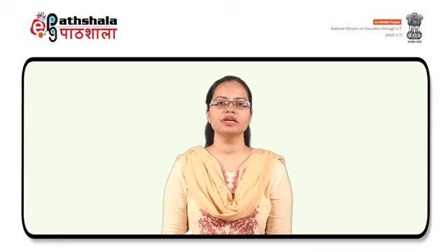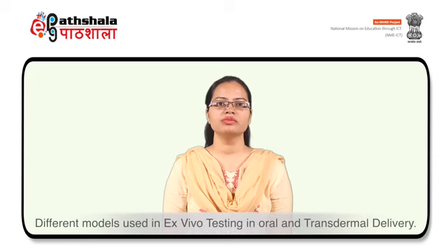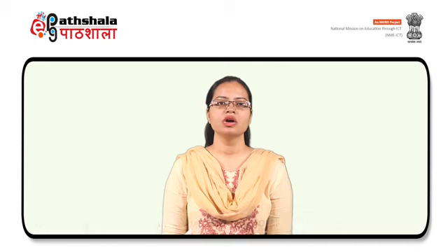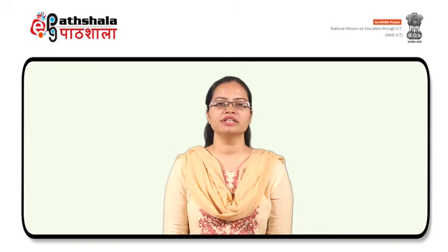In this module, we are going to discuss the ex vivo testing used for pharmaceuticals. The learning objectives of this module are: first, what is ex vivo testing? What are the different models used in ex vivo testing in oral and transdermal delivery? What are the different techniques for the ex vivo testing of products to be administered by the ocular, buccal and nasal route?